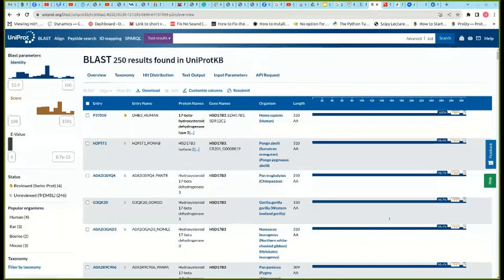Let me put the code on. 37058. So that's the one we are interested in. So let's just click this first one.